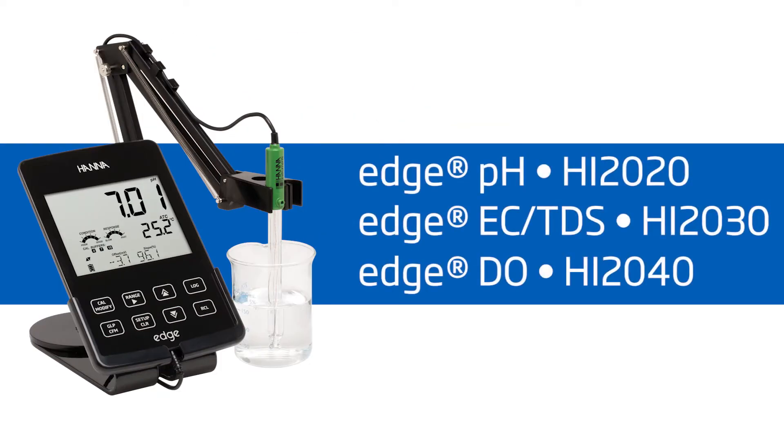Perfect for lab use, this advanced meter measures pH, conductivity, total dissolved solids, and dissolved oxygen.